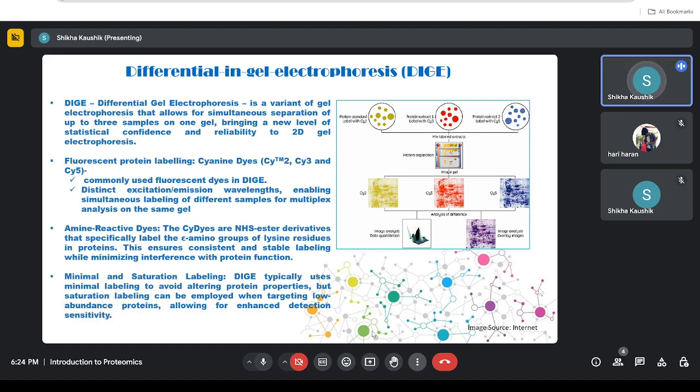I mean, you can analyze it in a more accurate manner, because if the spots are overlapping at that particular point, your overlay image will actually give you better resolution of your samples. I'll talk about it in detail. Right now I'm not commenting on this exactly here. But when we talk about the workflow of this particular technology, then you'll understand what exactly I'm saying. So both the questions are quite valid, and they are good questions.